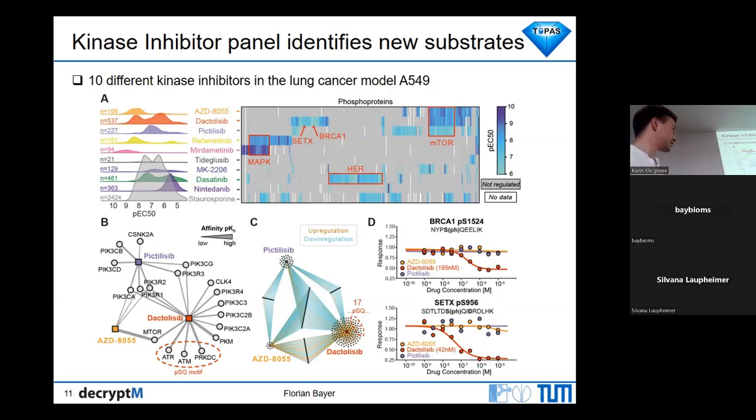Except for staurosporine, which binds to basically every kinase that's not hidden in 3 seconds. I don't know what percentage it is, but probably like 15, 20% of the phosphoproteome is regulated by this inhibitor alone, and you see this massive distribution that's all over the place. So good luck interpreting anything coming out of staurosporine treatment.